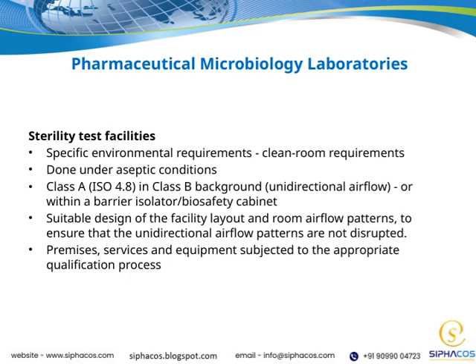Typically, we operate in a Class A environment, which is equivalent to ISO 4.8, within a Class B background. The Class B background provides a controlled environment with unidirectional airflow, which is essential for maintaining asepsis. Alternatively, these tests can be conducted within barrier isolators or biosafety cabinets that also provide a protective environment.